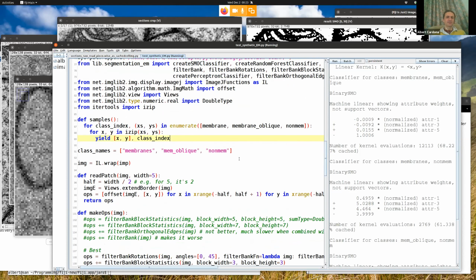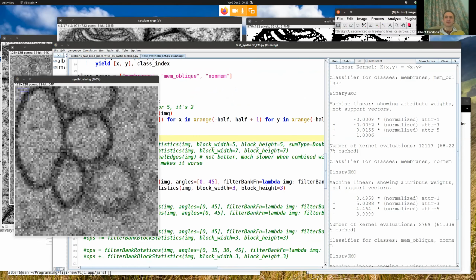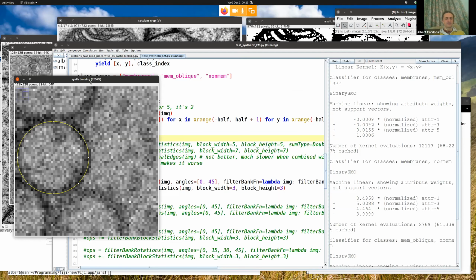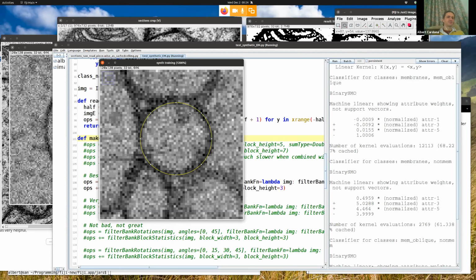I'm going a bit fast, but I think we should finish soon. And then some methods for reading basically a filter bank at every coordinate of these ROIs. Suppose you have an ROI like this, and you have 50 or 100 points all along this ROI. What you want is to be able to extract... Sorry, I want to pan the view here. What I wanted to do is extract the properties around any 1 pixel.